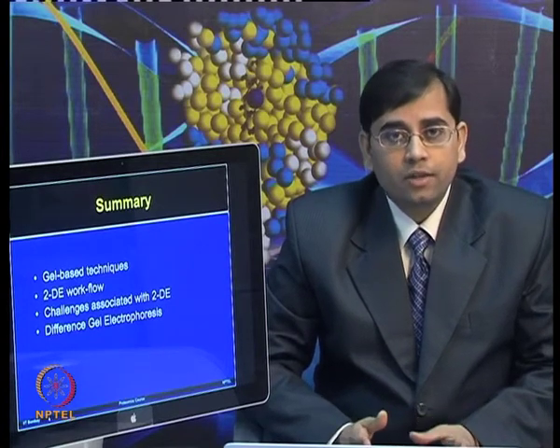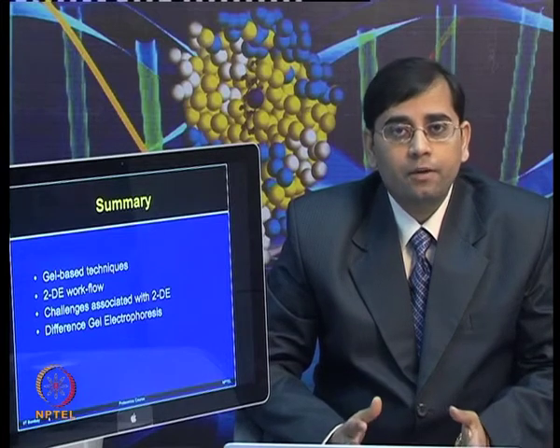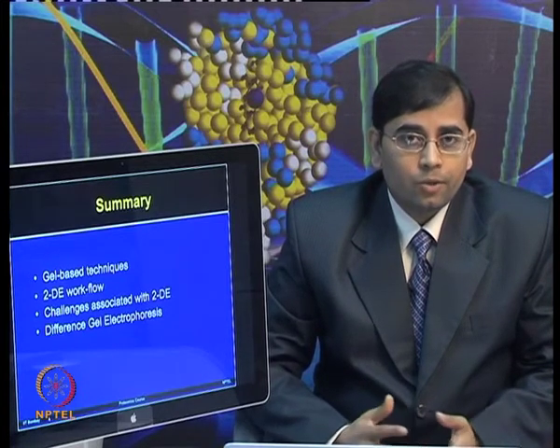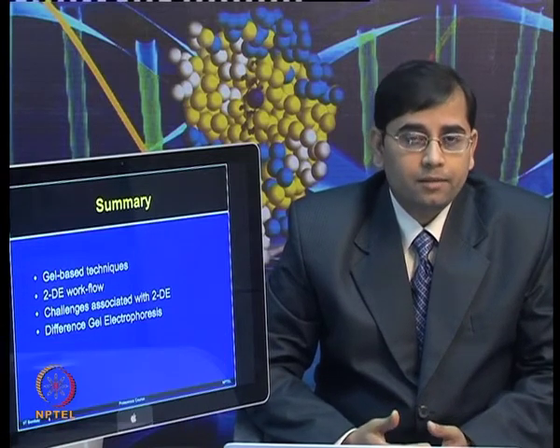There is no one technology which can answer all of your questions, but it is a good idea for you to know what different methods are available for you to use. So I hope that by taking this module on gel based proteomics, you are now familiar with different types of gel based techniques. These are only a few, and there are many other methods available, but these are the most commonly used methods which people are applying in the field of proteomics.